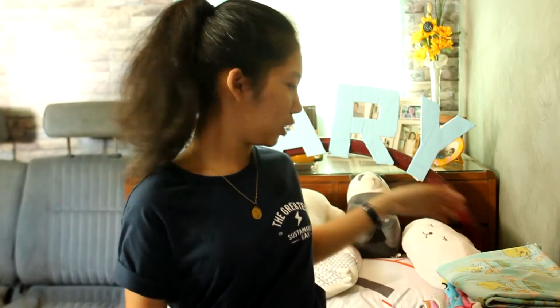There's a note here to not attempt a dissection of the brain because this tissue is particularly fragile and difficult to work with. Number 1 is to get the newly euthanized toad and fasten it ventral side up to the bottom of the dissecting pan by means of pins inserted through each of the 4 extended limbs. So, imagine the frog with the limbs pinned. The ventral side is the front.